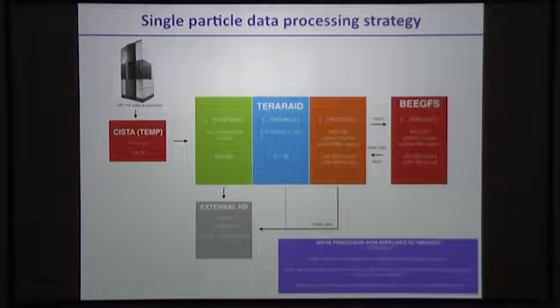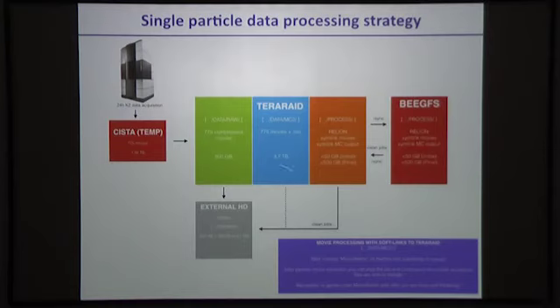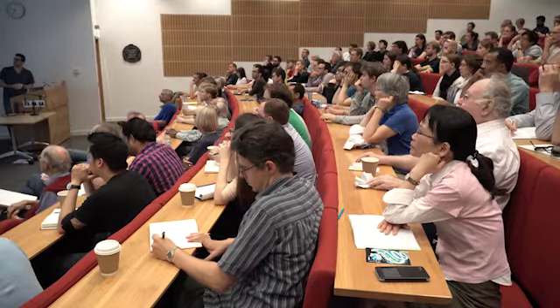Before we start, let me just mention this briefly, and I think it's important. This is a bit specific for the LMB, but I guess it works everywhere. We're generating a lot of data, and resources for data storage and for computation are scarce, especially if you have a lot of users. So everybody should be aware that we're generating a lot of data. This is just a particular example of one data set that I collected recently.